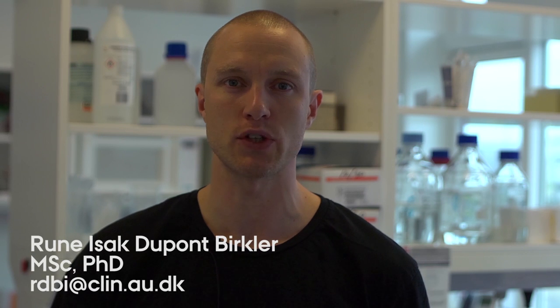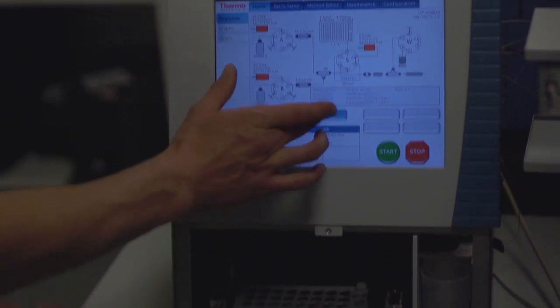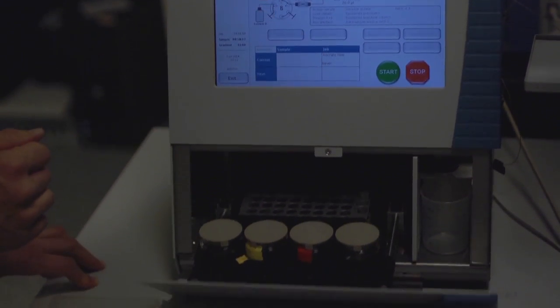Proteins were quantified using our triple quadrupole mass spectrometer. We used selected reaction monitoring, SRM, for the quantification of disease-associated proteins. Heavy-labeled synthetic peptides were spiked in equimolar amounts into each of the samples prior to MS analysis. We designed the SRM method to monitor a total of 5 transitions for each of the monitored peptides.